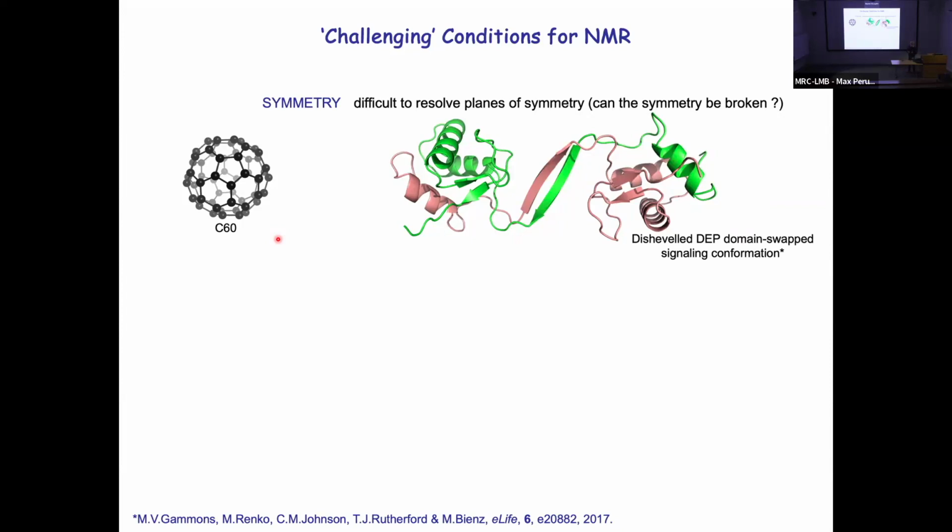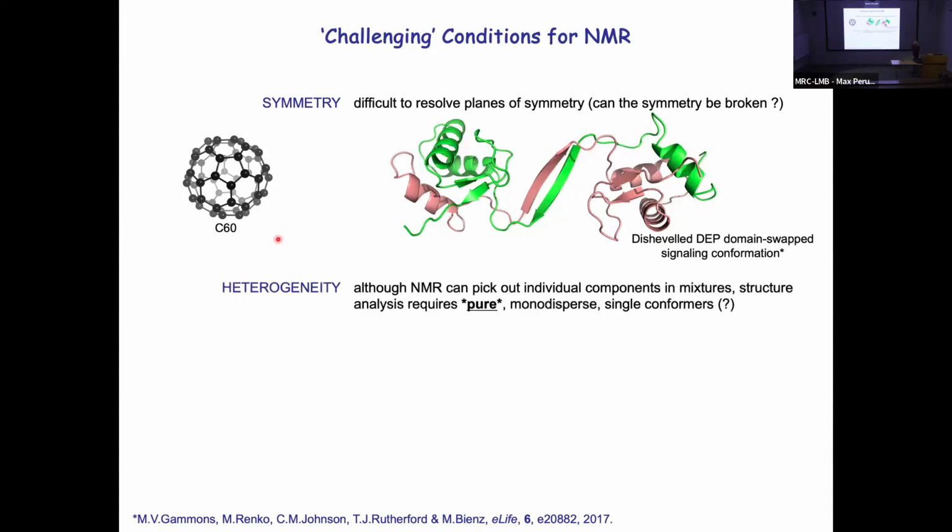So you get one single carbon signal for Buckminster fullerene, and you have to then produce a ball in which all 60 of those carbons are in an identical environment. So the symmetry component was an essential part of working out what the structure of it was.